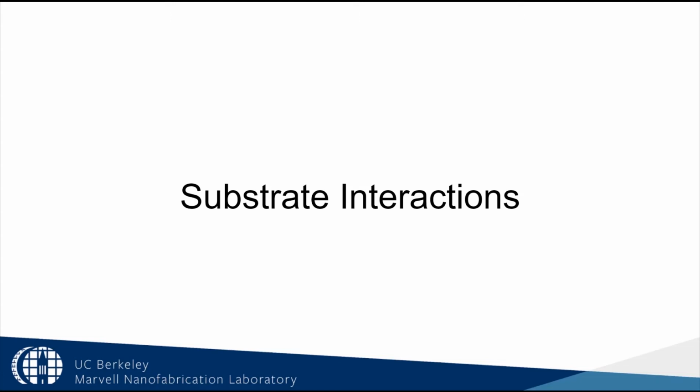Welcome back to video 2 of the two-part SEM class video series from UC Berkeley's Marvell NanoLab. In this video, we'll be learning about how our substrate will interact with the electron beam to form an image.